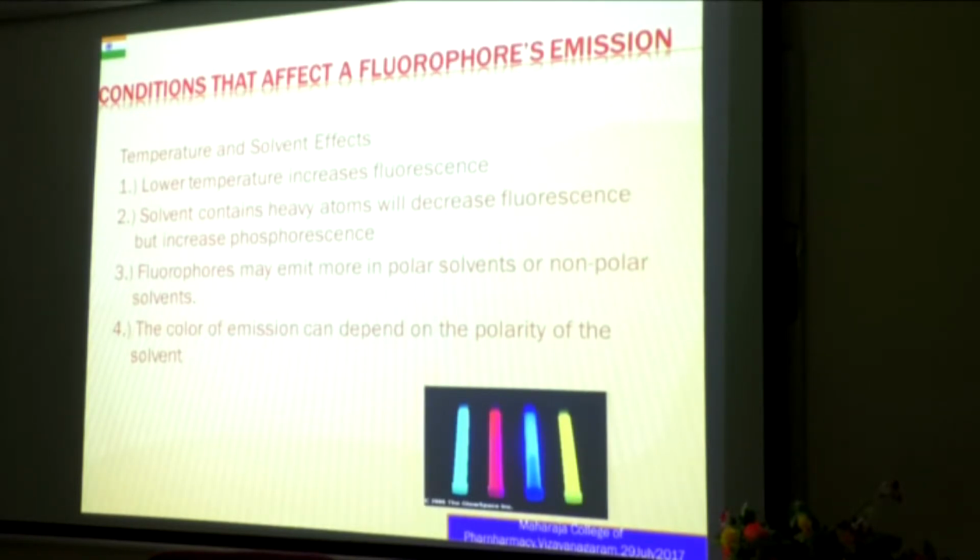Solvent also: heavy atoms will decrease the fluorescence, heavy atoms like mercury or bromine or iodine reduce the fluorescence. It may emit more in polar solvent or non-polar solvent. You need more experience when you deal with the technique. You will understand this. It comes by experience.